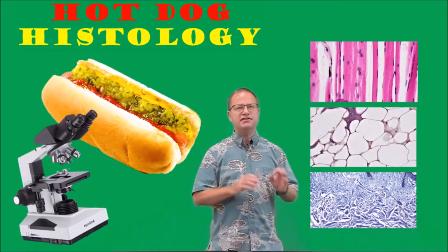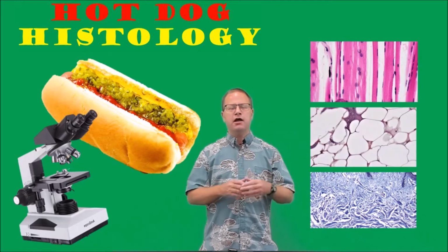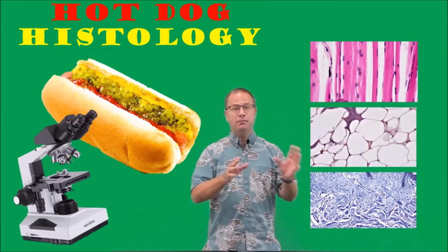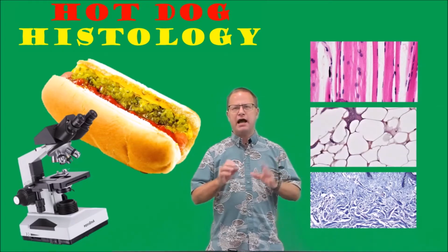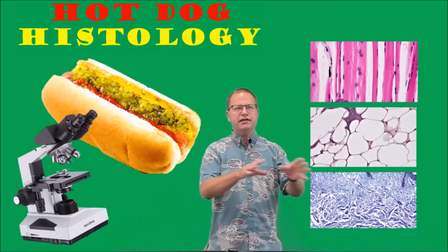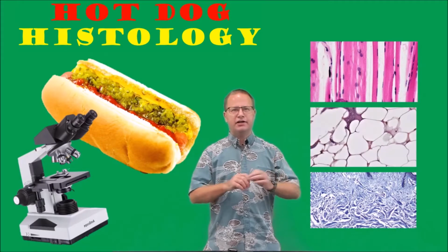Now, as you probably know, histology is the study of tissues, and tissues are groups of cells that are joined together to perform specific functions. Most of you that are enrolled in biology or anatomy classes have probably spent hours and hours looking through the microscope trying to identify the different types of tissues on those microscope slides. Well, today we're going to kick that up a notch.